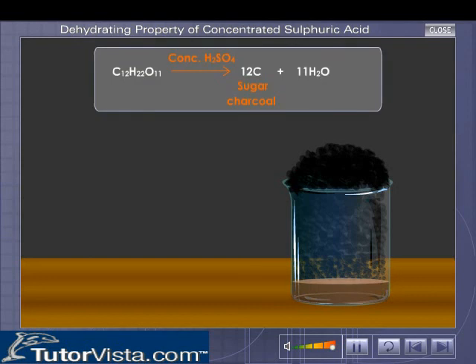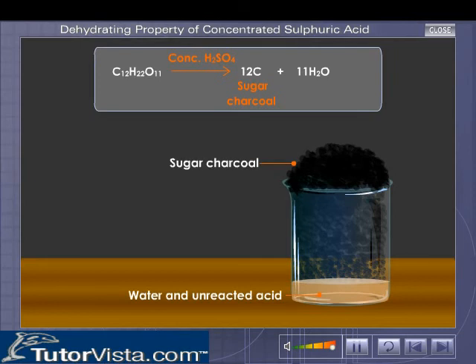The mixture starts frothing because of the heat being generated by this exothermic reaction. The black mass formed is pure amorphous carbon, called sugar charcoal.